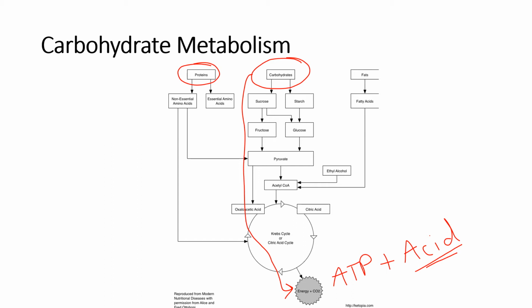For this lab, you are going to be investigating if your unknown bacteria has the ability to break down different types of carbohydrates to produce the ATP that the cell needs. The indicator you are going to use in most cases are pH indicators, which will indicate if there's a decrease in the pH during the reaction.